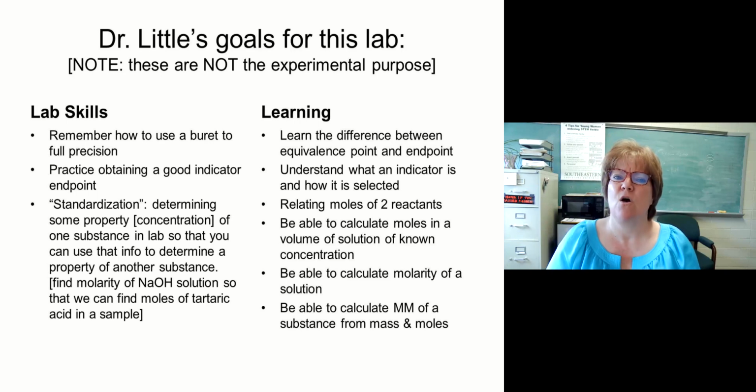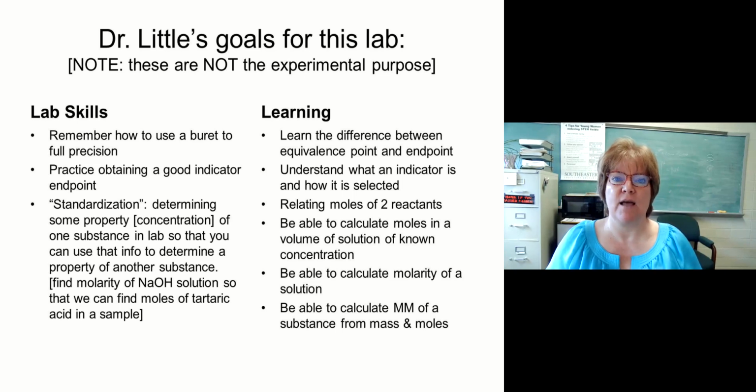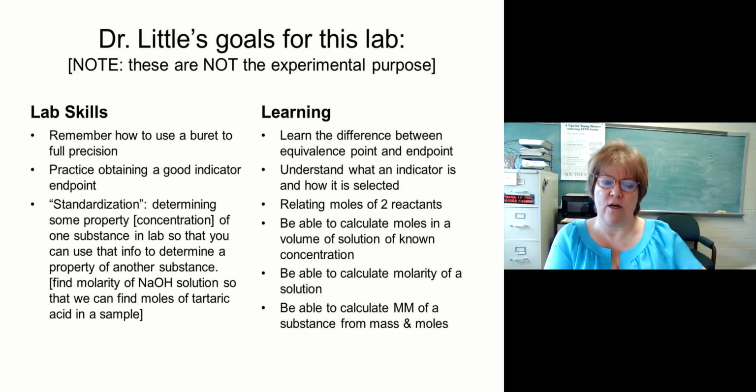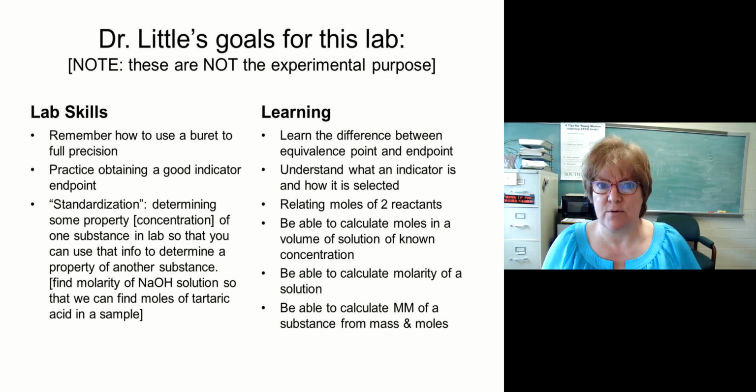So on lab skills, we want to learn how to work with a burette and getting a good endpoint, nice light pink endpoints. Also, we want to understand this concept of standardization. You're getting used to the fact that you come into lab and there's a chemical sitting on the bench and it's got a known concentration on it. That's not all that typical.